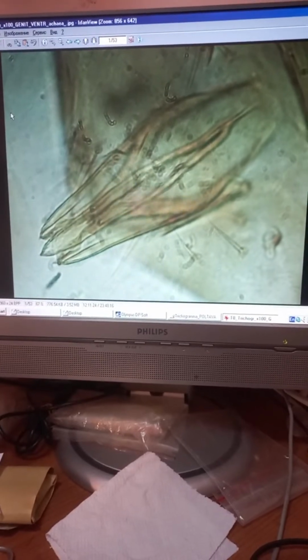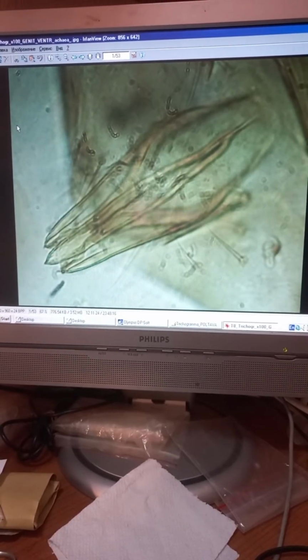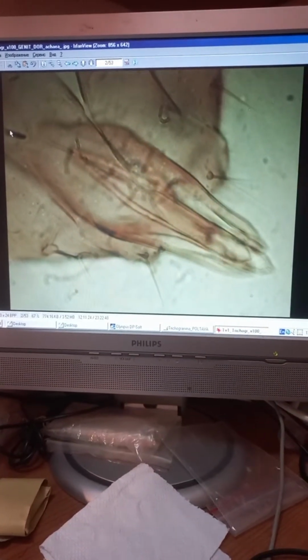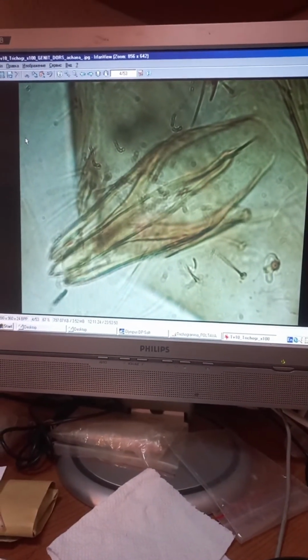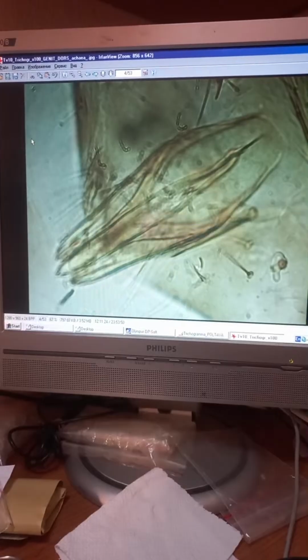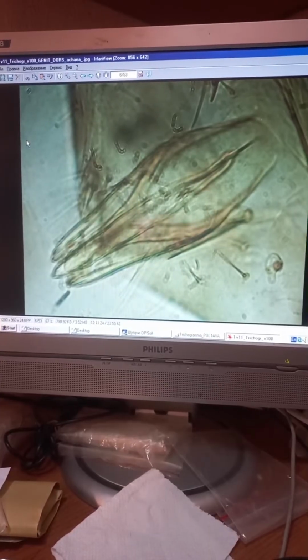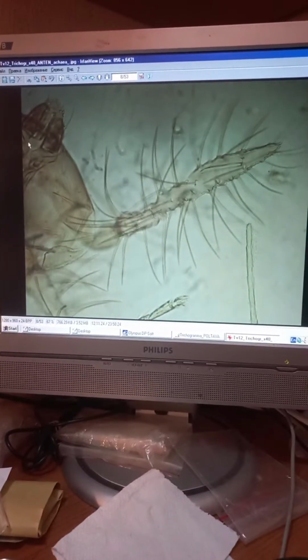Let's see pictures. Let's see Trichogramma achaeae, photos of male's genitalia and other details of morphology. This is male's genitalia of Trichogramma achaeae with a very elongated dorsal aperture. This is size indicated, the same long dorsal aperture, male's genitalia. This is some magnification size. And I change the positioning of focus up and down to watch details under different focus.